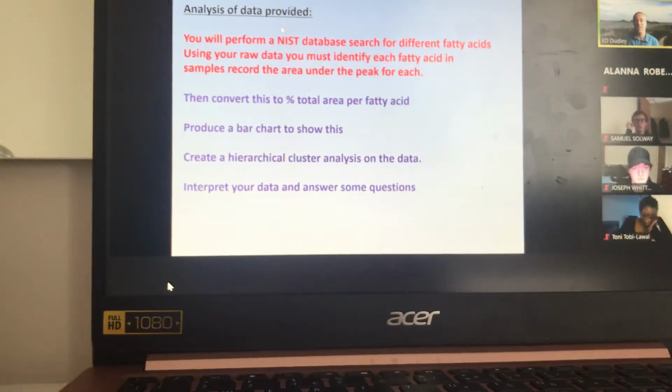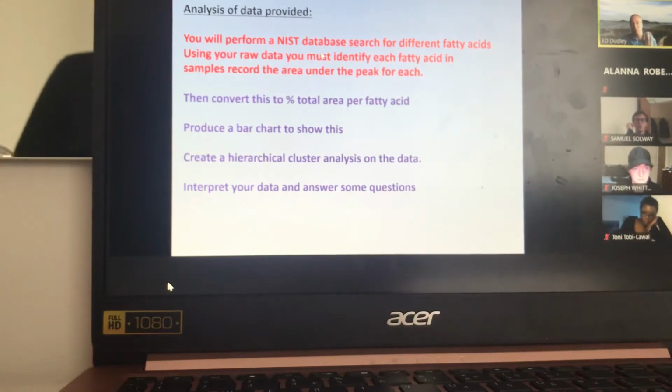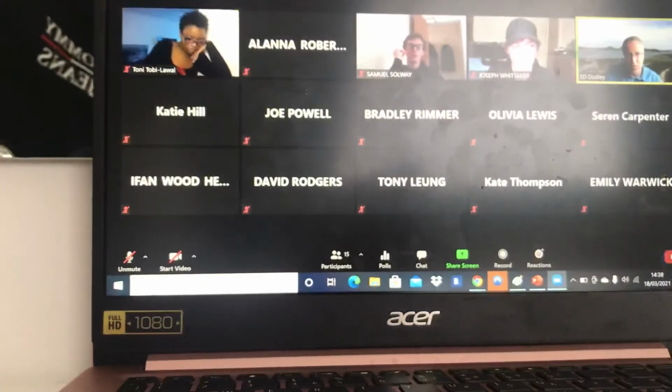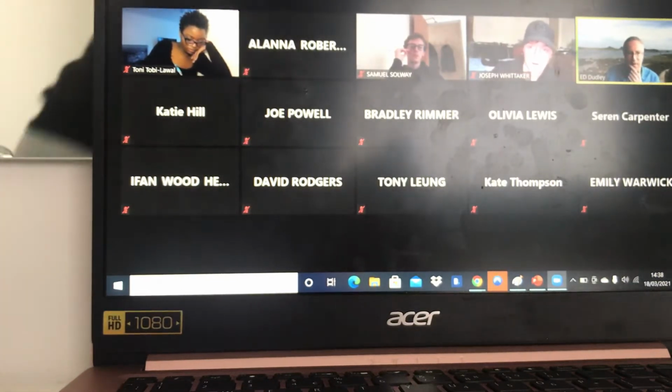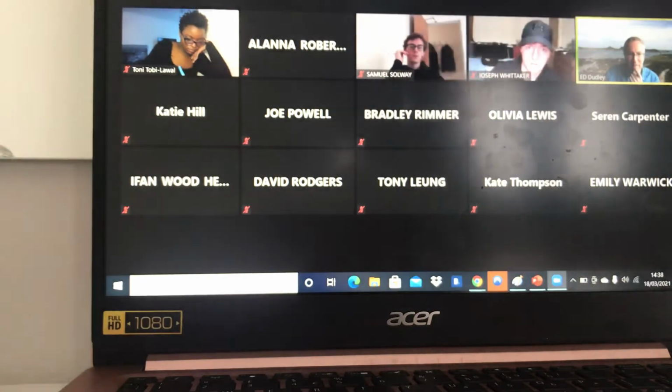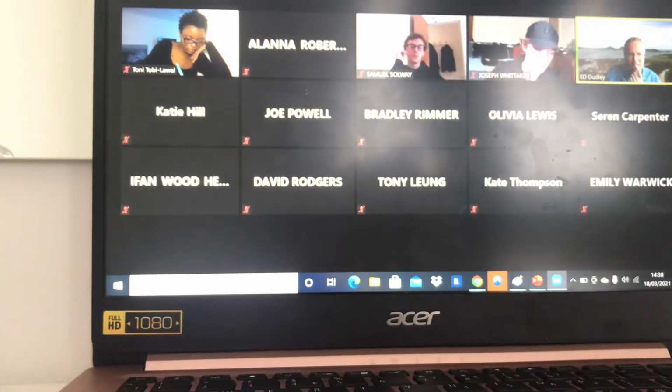So for the analysis, you've got to do a number of things. The first thing is identify which peak is what fatty acid. If I stop this, I'll show you what's on canvas, because that will make more sense, I think. If I go into the PowerPoint and go here.